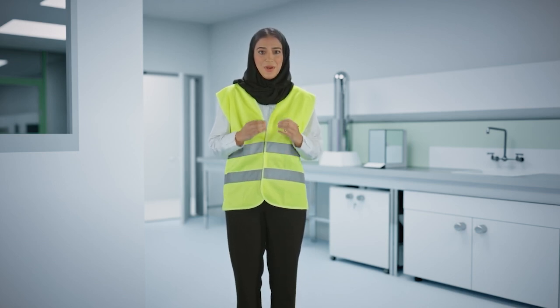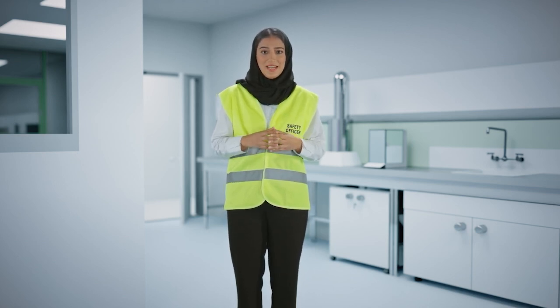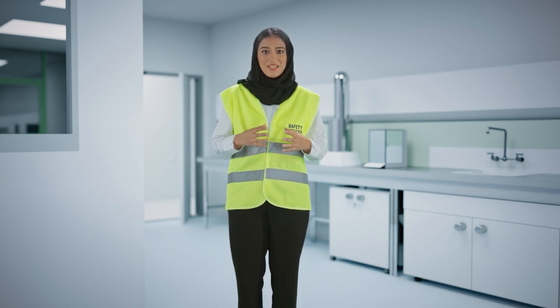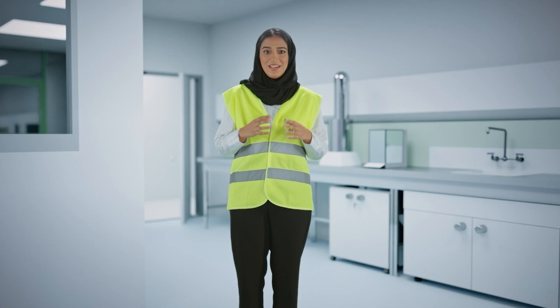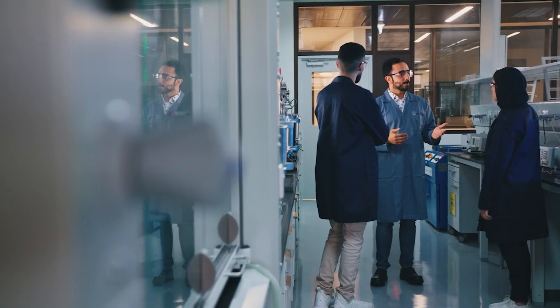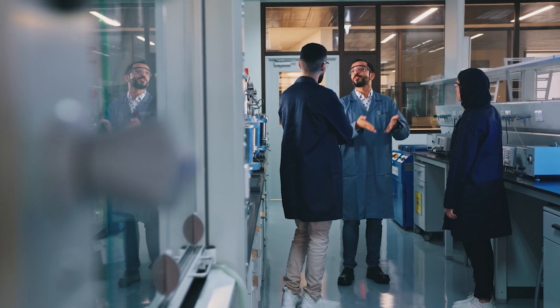Laboratory safety is of paramount importance, and that is exactly why the safety resources have been developed to encourage and promote safe and efficient working practices in every laboratory. Working in laboratories poses potential risks and threats. Therefore, there is always an instructor present to offer guidance and assistance. The instructor's responsibility is to ensure a safe working environment in the laboratory.